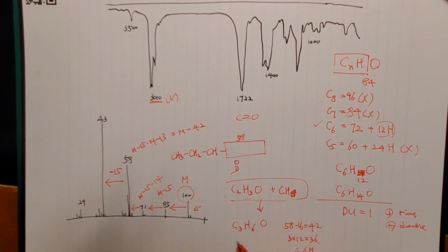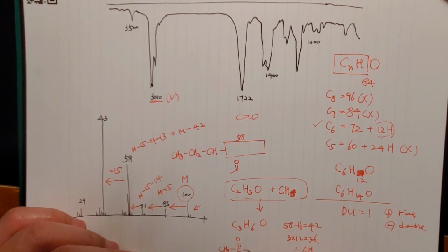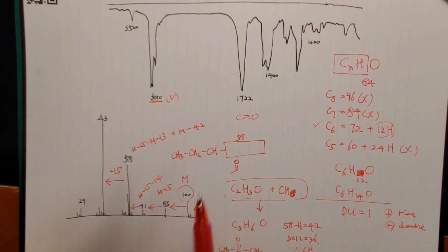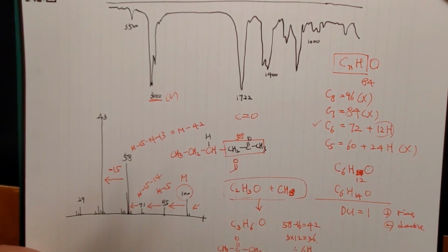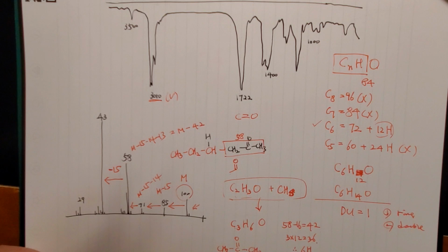But the dilemma I can see right away is this is an acetone. Actually, like, CH3 to be a ketone, you need that, and then a methyl group. So they're fully valenced units. So how would you connect this there? You can't. Doesn't make any sense, right? But you notice here, this carbon has only 1 hydrogen, not 2. So what if we do this, and add 1 hydrogen here after taking 1 from there? Then this unit is not going to be 58, right? It's 57.